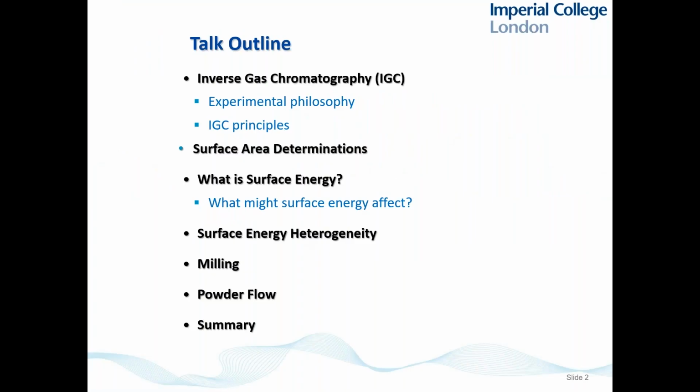So the plan for today's lecture is to explain this technique called inverse gas chromatography. As I said, many of you won't know anything about it. We'll talk a bit about some quite basic measurements you can do around surface area. And then we're going to spend most of the discussion today on surface energy. First, we will have an introduction to what surface energy is and some examples of why it's important in allowing us to understand powder behavior, particularly for pharmaceutical materials, in terms of milling, crystallization, and also powder flow. So that's the agenda for today's presentation.